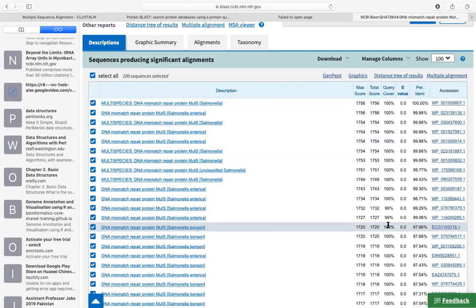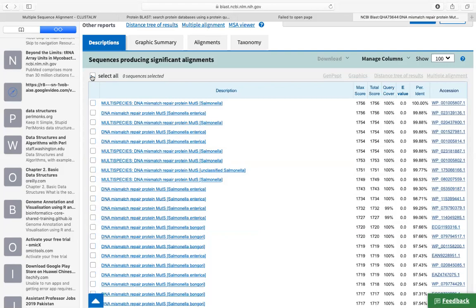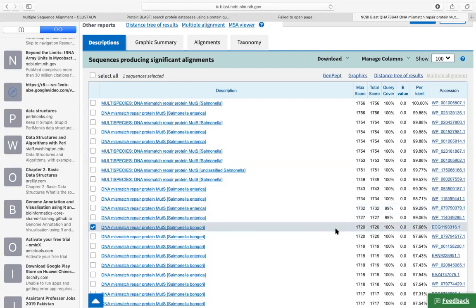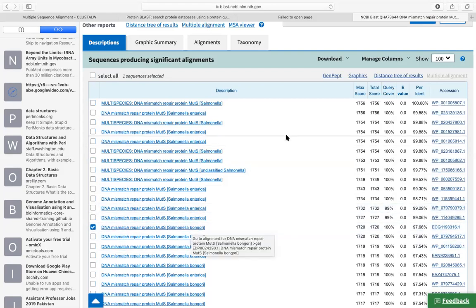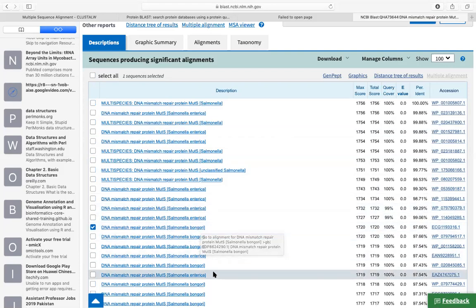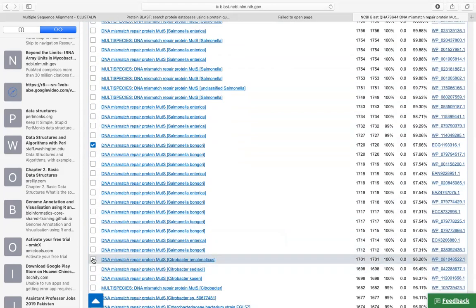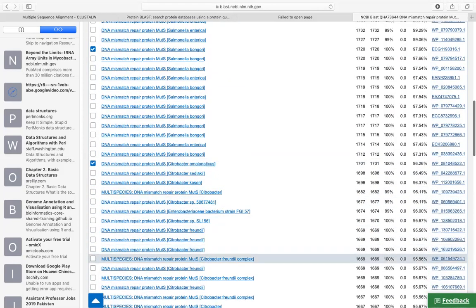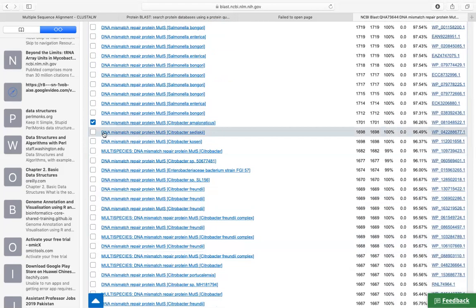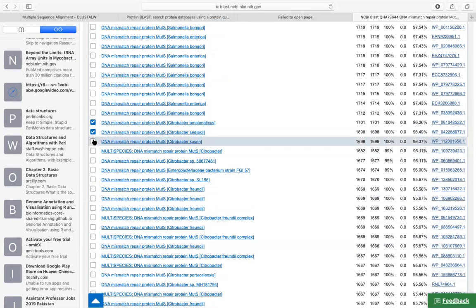I have told you: query coverage, percentage identity, and E-value — these three parameters you use to interpret BLAST results. Here we are going to select sequences. These are almost the same, so you have to use one. We are taking four species: Salmonella enterica we already have; we will also take Salmonella bongori, Citrobacter, and another species. Checking query coverage and identity percentage — I will use this one. Now I have three sequences selected.